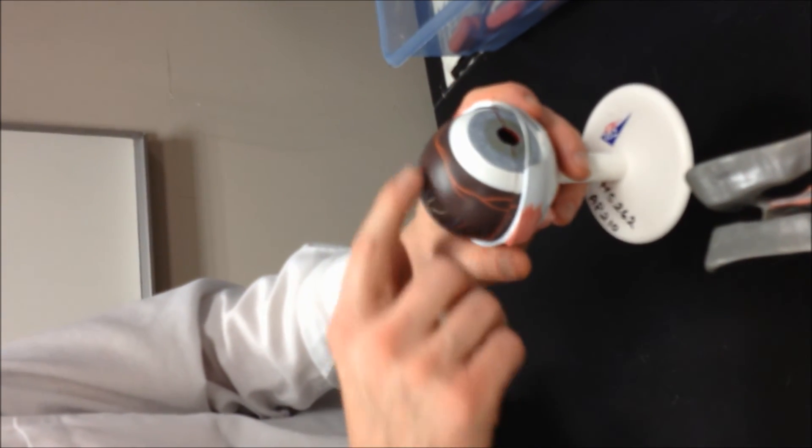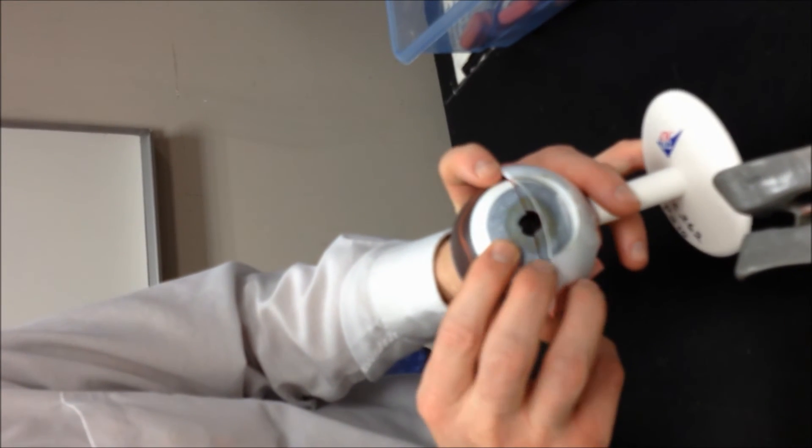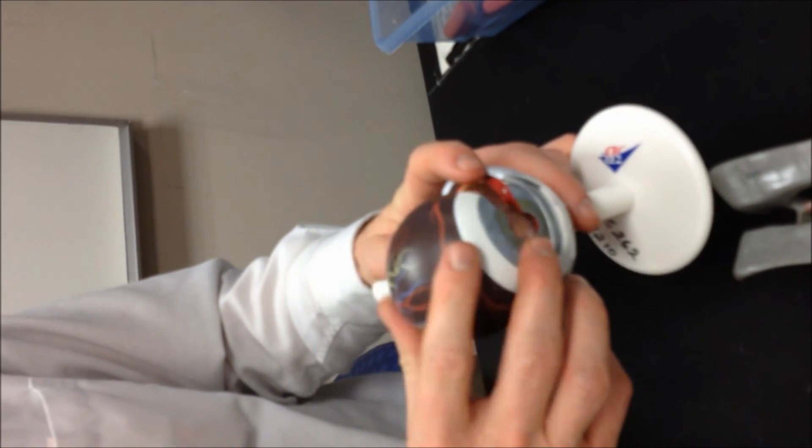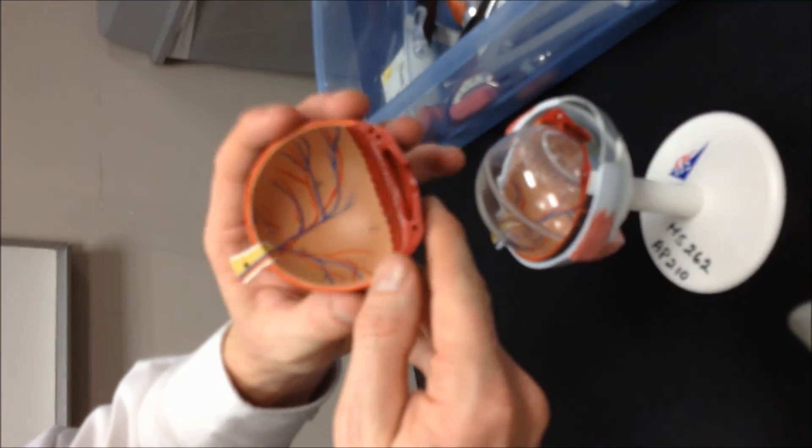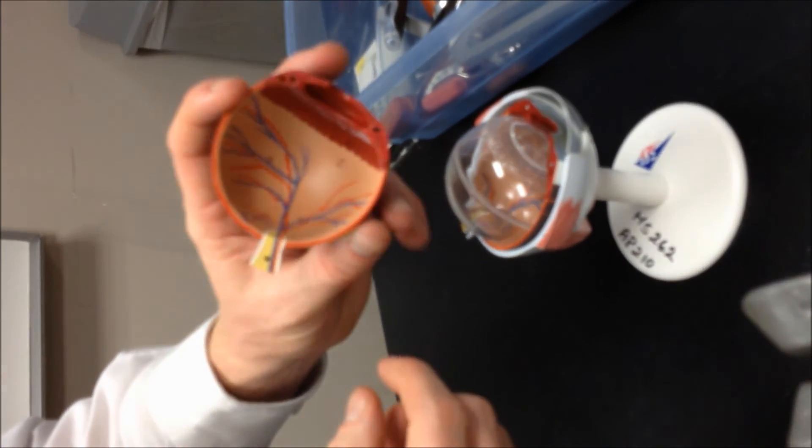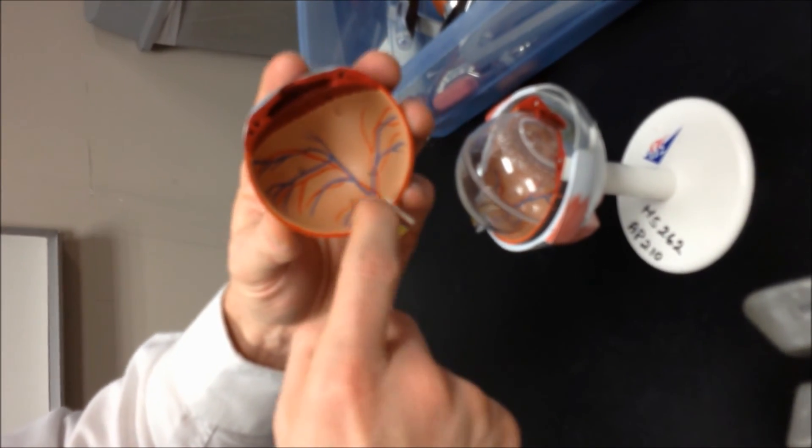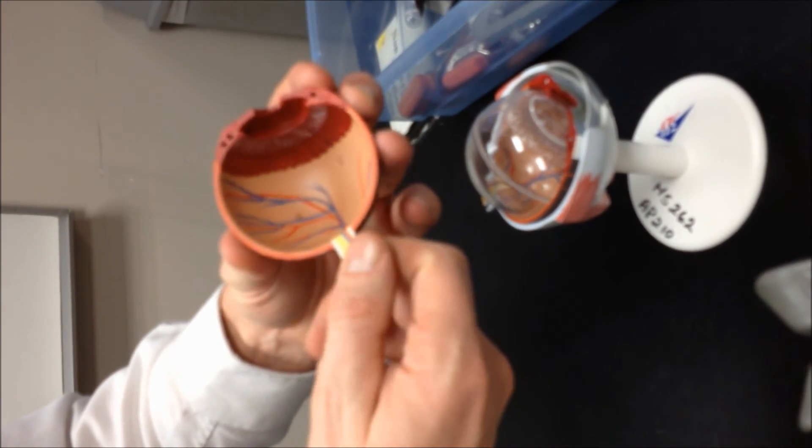All right. Take that apart. Then you'll see the choroid, the darker layer beneath the sclera. There we go. Pull that apart. So inside, you're going to have the ciliary body. And then the innermost layer is the retina. And the retina will attach to the optic disc, which becomes the optic nerve.